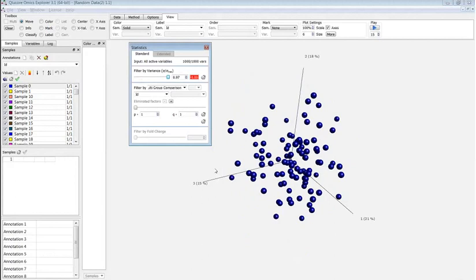I think that concludes the introduction to the concept of projection score as used in Qlucore Omics Explorer. As I said, the article contains the mathematical foundations and further information on examples where people have used projection score to obtain optimal filtering.